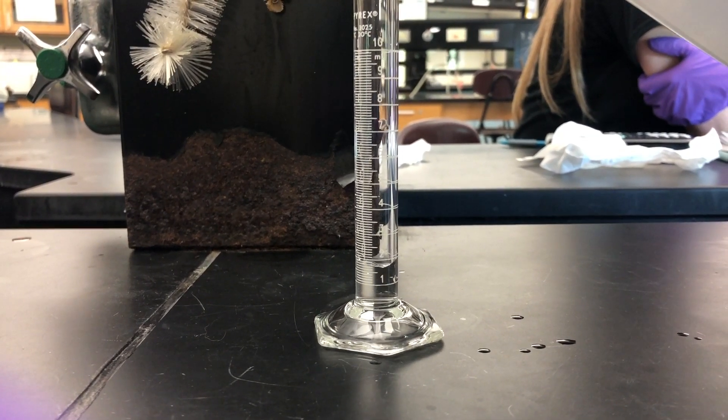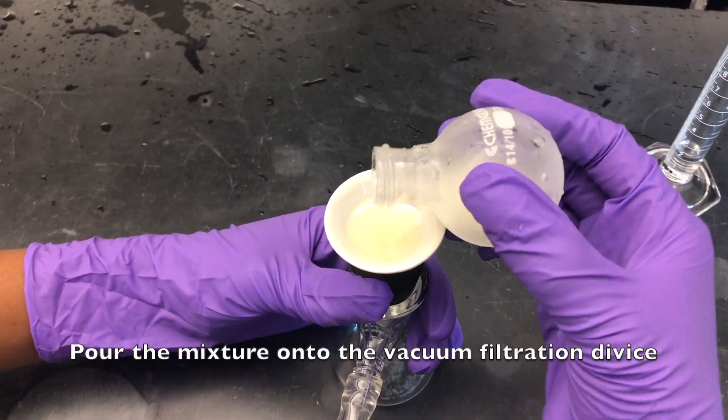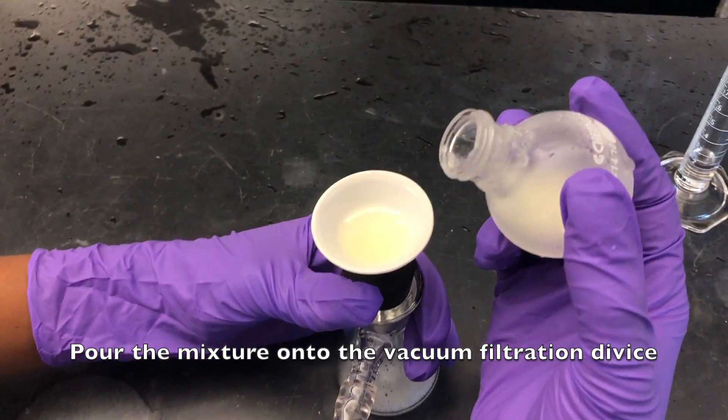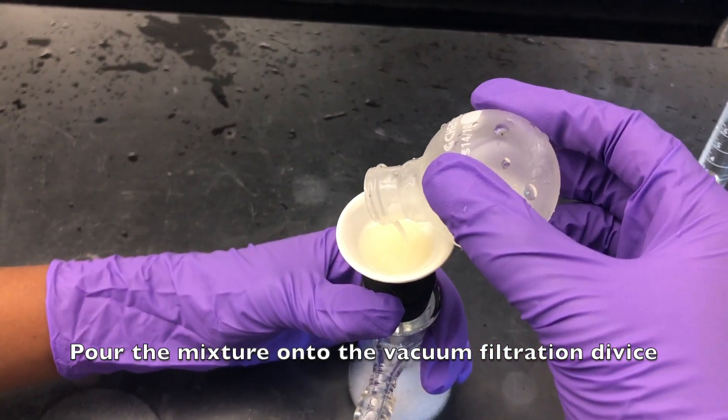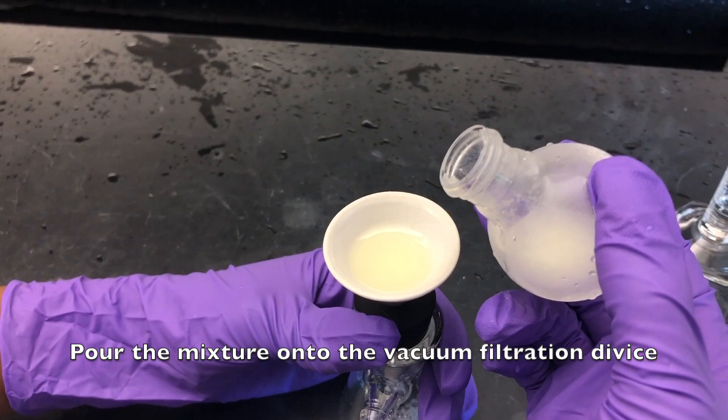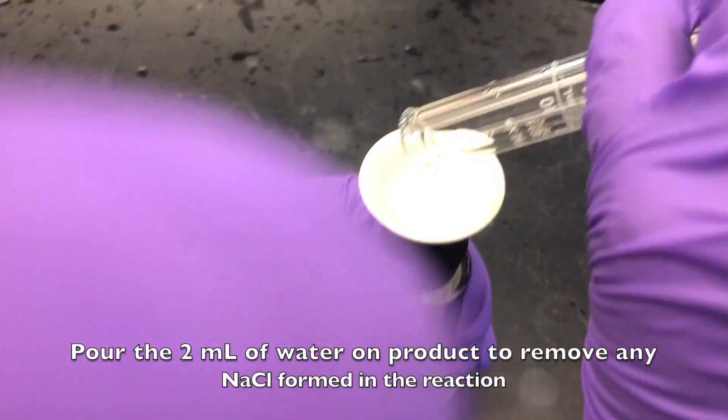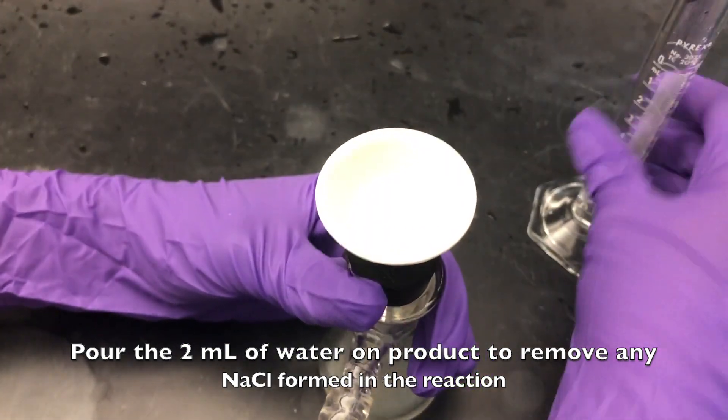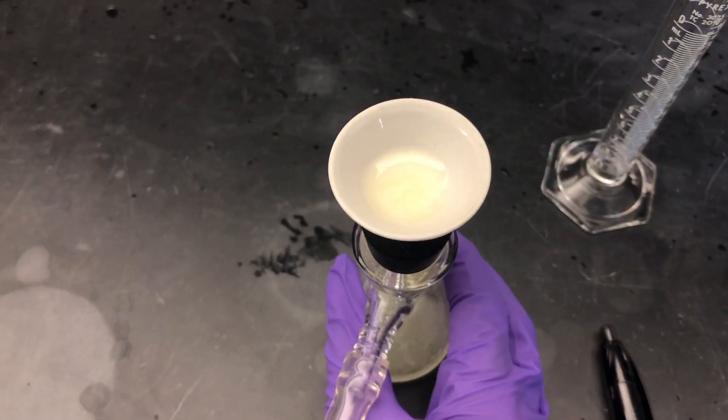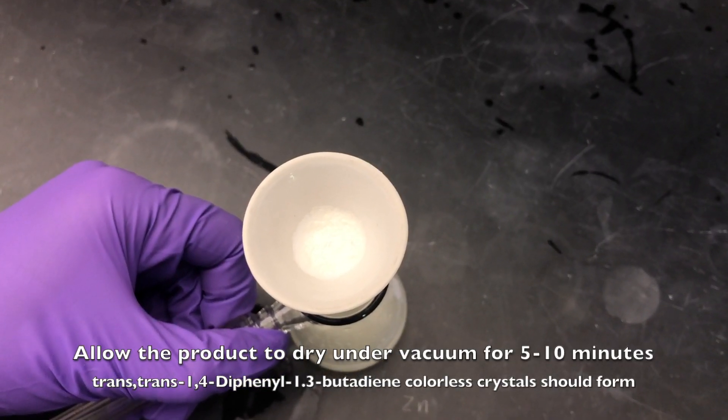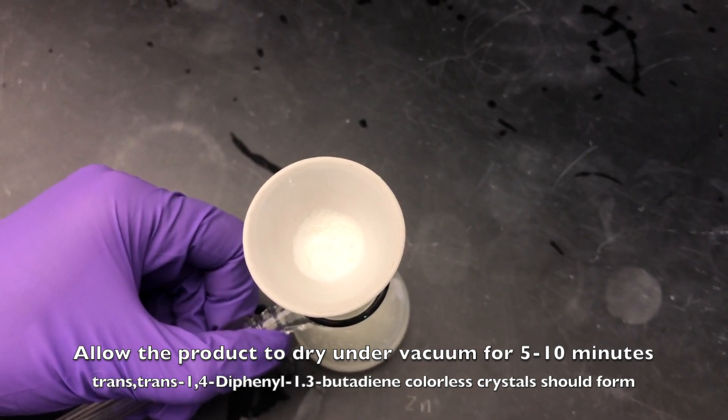Measure 2 milliliters of water for later use. Pour the mixture onto the vacuum filtration device. Pour the 2 milliliters of water on the product to remove any sodium chloride formed. Allow the product to dry under the vacuum for 5 to 10 minutes.